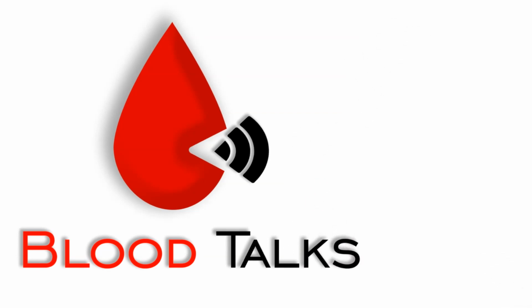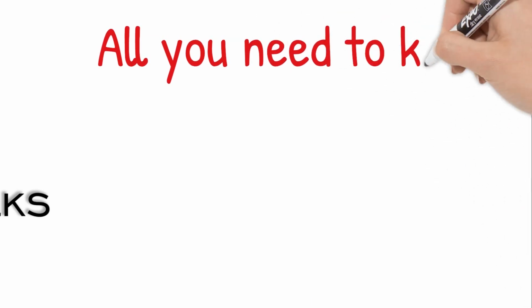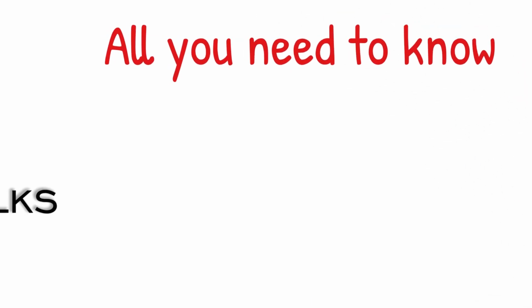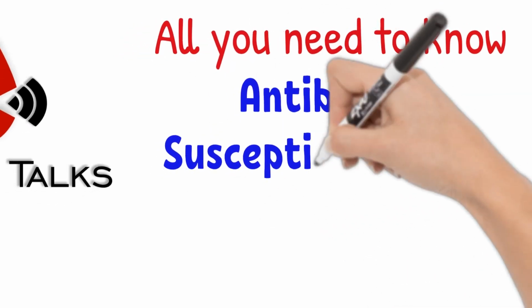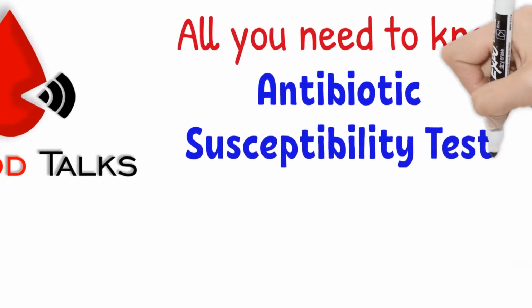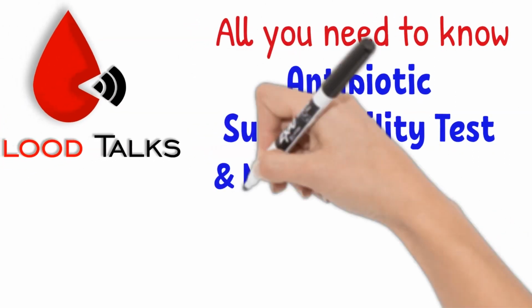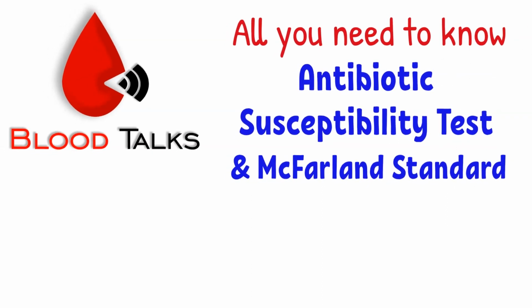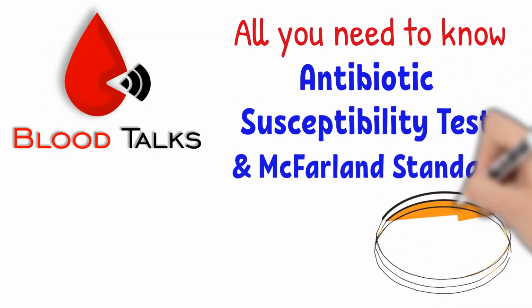Hello Blood Talk fans! Today's topic continues from last week's video, where we talked about differentiating types of bacteria between gram-positive and gram-negative bacteria. Once we know what types of bacteria cause an infection, we can treat the infections accordingly. But to treat an infection more effectively, we need to know which antibiotic works and the dosage. Therefore, we will be talking about antibiotic sensitivity tests by Kirby-Bauer methods, or disc diffusion methods, today. I will include how to make McFarland turbidity standard to prepare the inoculum in this video as well.